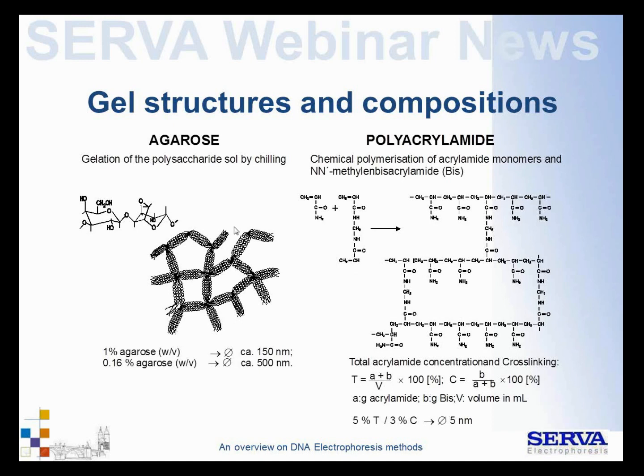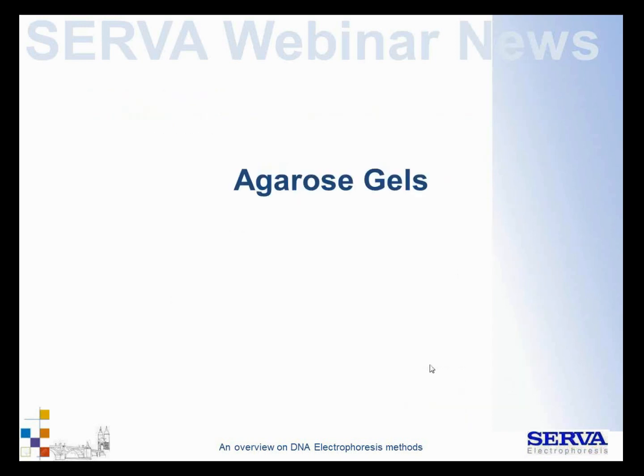the applications. So for larger nucleic acid fragments, you are using agarose for separations. For small fragments, up to about a kilo base, for some amplification, PCR amplification fragments which are short, you are using polyacrylamide gels. I will come back to this in a moment.